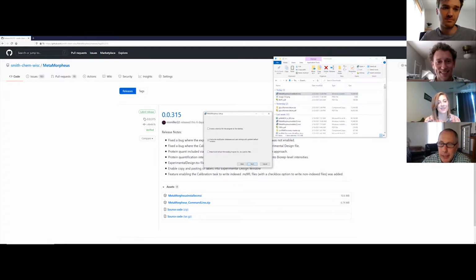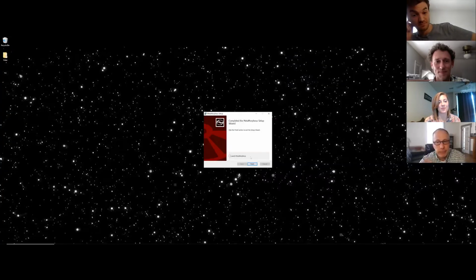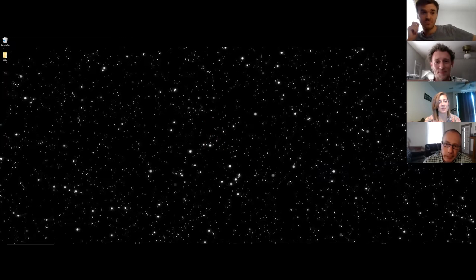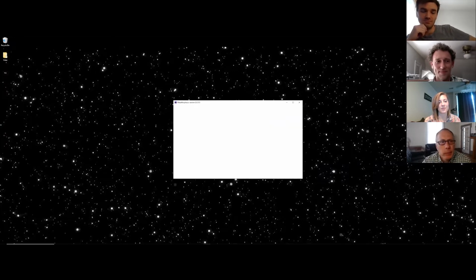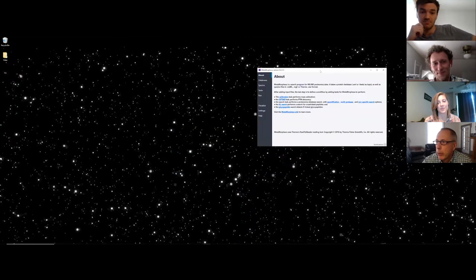Next, install. All right, and we're just going to launch MetaMorpheus. And there you go. So MetaMorpheus is now totally installed.